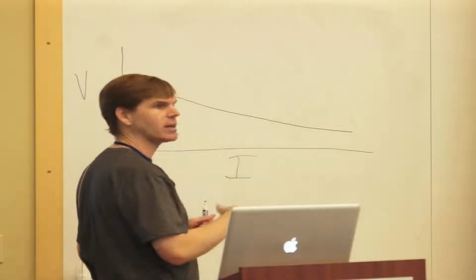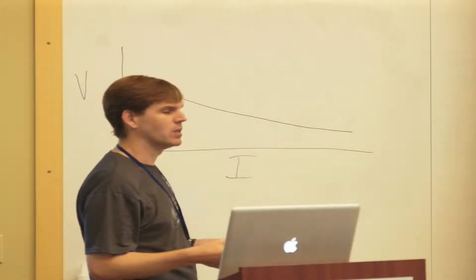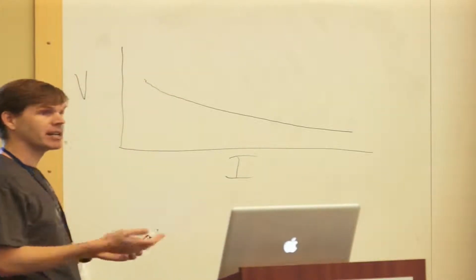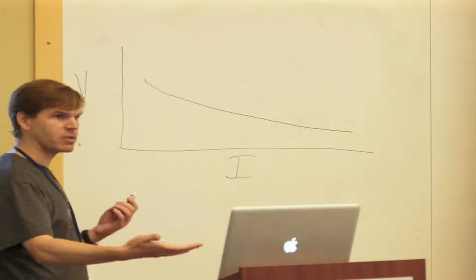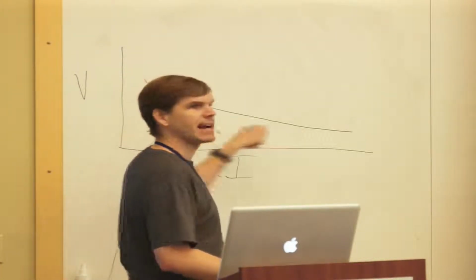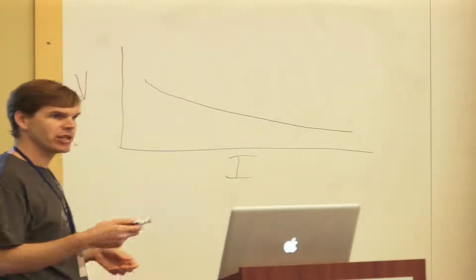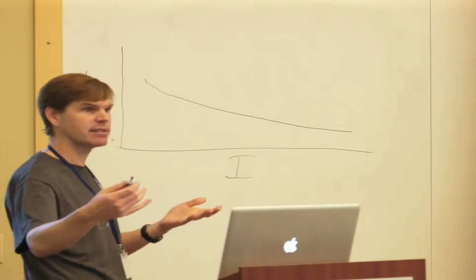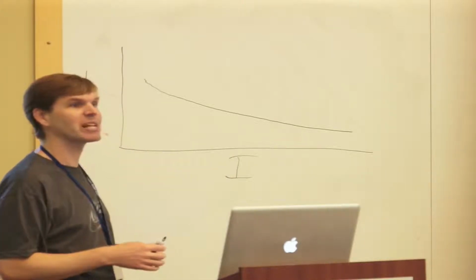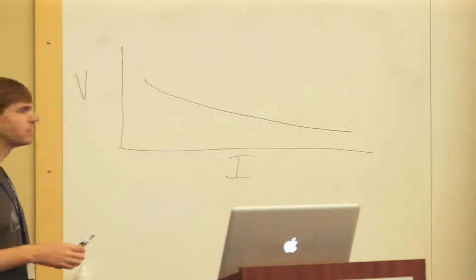Variance stabilization transformations, the general concept is to try to level this out so that as we apply visualization techniques or other statistical approaches that make assumptions about the variance being similar for the things that we're testing, that's actually true. So there's variance stabilization transformation, the general concept, and then there are specific implementations of it, and the Lumi package has one called VST.